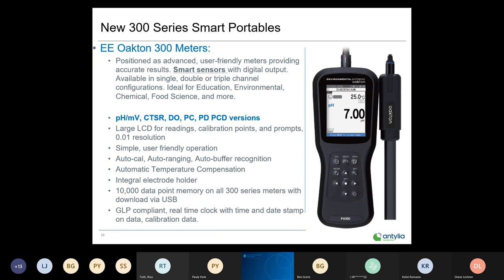The new 300 smart portables — a super cool instrument — represent Oakton's first offering of smart sensors. A smart sensor is a digital sensor, whereas the 200 series still uses analog technology. This is truly a 21st century instrument with digital input and output on the meter and sensor, available in single, double, or triple channel configuration.